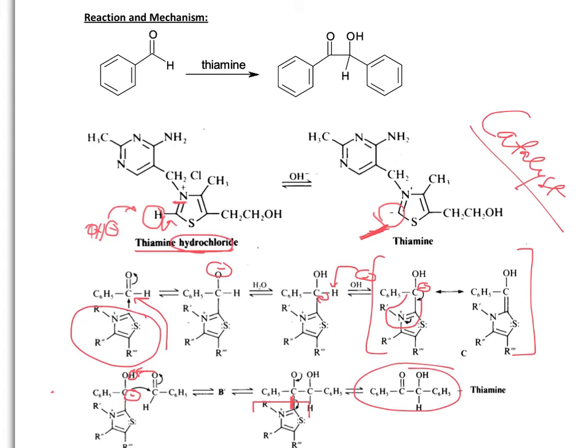So tomorrow, for Wednesday's class, what you will do is you're basically going to put everything together, mix it, swirl it well, label it, and leave it on the tray. And then through the week, it's going to crystallize, crash out. When you come in next week, you're going to filter the material. You're going to then take the steps necessary past this point of time.